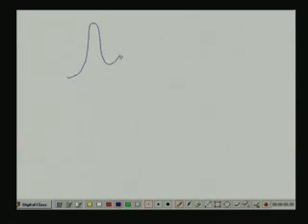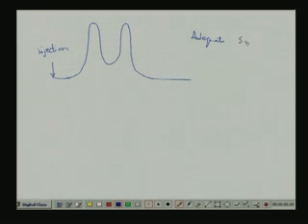You see here, these are the injections I have made here. This is adequate selectivity, but poor efficiency.